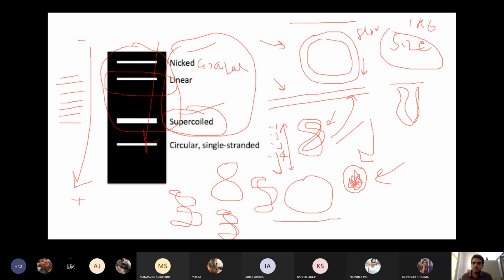Okay, so now the discussion is open. If you would like to ask anything from today's discussion, we will continue our lab in our next laboratory session also, in which we will describe how gel electrophoresis really works, and when you are on the campus, how to perform these experiments. And also in the VLab portals, we will see how you are going to make the gel, how you are going to run the DNA sample inside, and what different components are going to be there in your gel electrophoresis experiment.